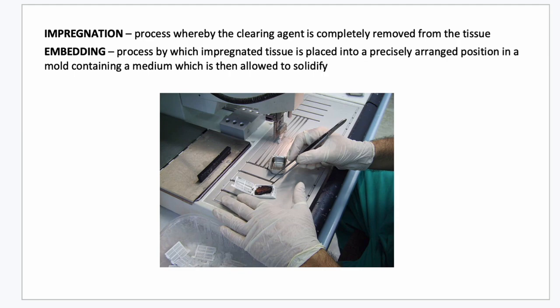So unsa may pasabot sa impregnation, no? Pregnant, di ba? Murag imong putangan og bata ang mattress, no? So murag gi-feel nimo og bata ang mattress. So it's the same with igay mo na to sa istopat, no? First imuhang itanggalon ang clearing agent, no? Then imo siyang i-replace katong clearing agent, 'di ba?